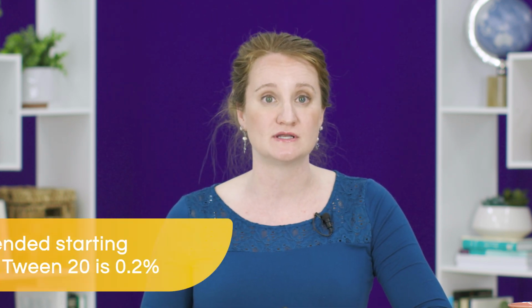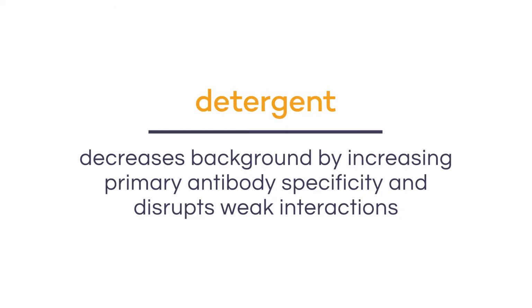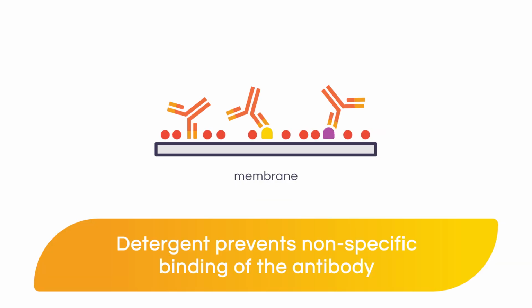The most common detergent used for Western blots is Tween 20. You can optimize the amount of detergent that you use for your primary antibody solution, but the recommended starting concentration is 0.2%. The role of the detergent is to decrease the background by increasing the specificity of your primary antibody. The detergent will disrupt weak interactions between the primary antibody and non-target proteins, or between the primary antibody and the membrane. This prevents non-specific binding of the primary antibody to the membrane or non-target proteins.